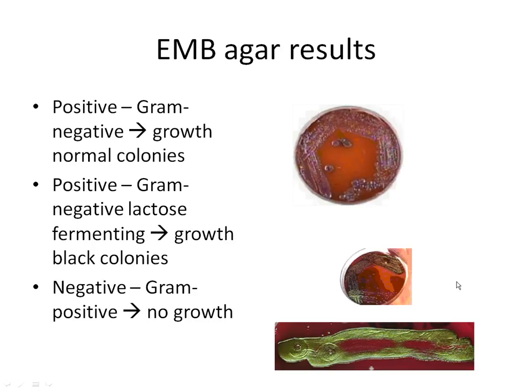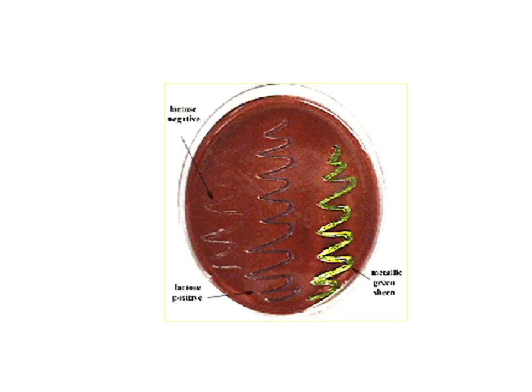This next image shows an EMB agar streaked with three different bacteria. In the first streak, there is a line of bacteria growing in a whitish color. Since it's growing it is gram-negative, but having no color means it cannot ferment lactose. In the second streak, bacteria is growing in a dark purple-black color, representing a gram-negative that does ferment lactose. The third streak is also growing — gram-negative — and shows a metallic green color, which is characteristic of E. coli. Any time you see this metallic green color, it automatically indicates E. coli is present.